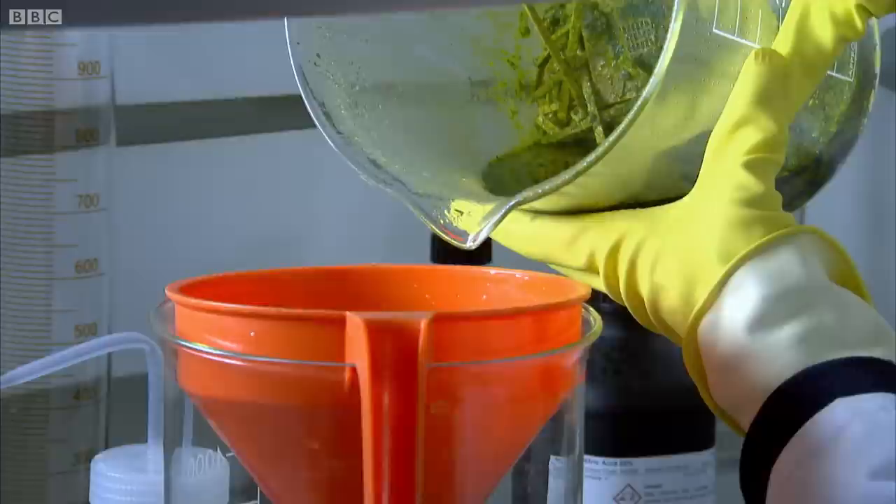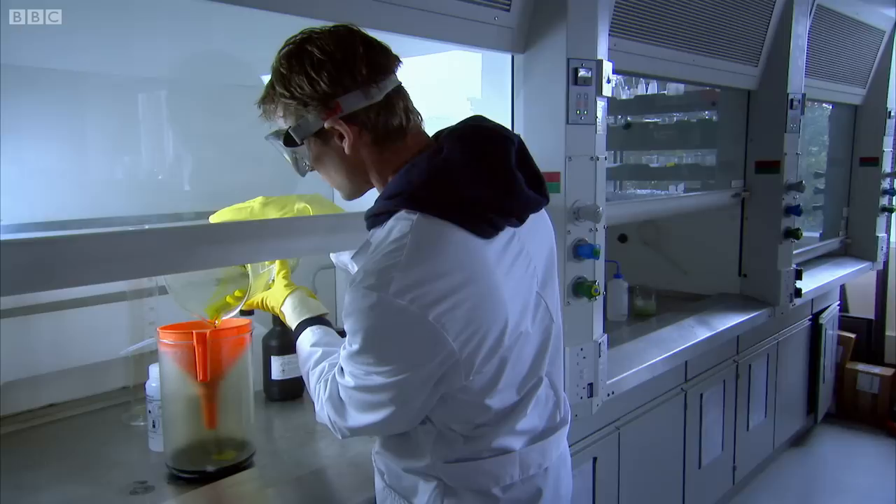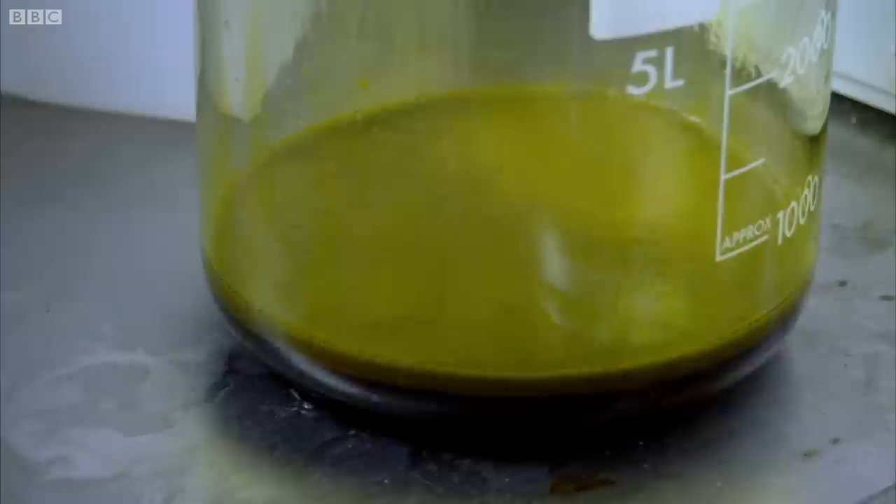Can you look at that dirty black liquid I've just made? It's difficult to be confident that it's full of gold — it's a bit of a leap of faith. Now I've dissolved my gold into a liquid, all I need to do is pour it through a filter to separate the gunk from the good stuff. I'm not sure about this — I seem to have made pure green, not gold.